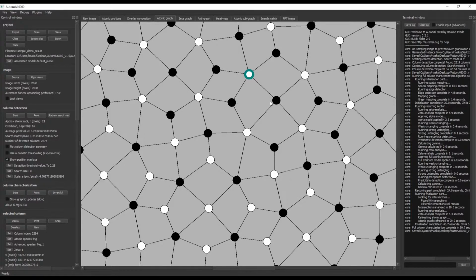Now for aluminium, it takes on 4 opposite plane nearest neighbors. And again, we can see that the program has correctly selected this as aluminium because it has 4 symmetric arcs. And then finally, magnesium takes on 5 opposite plane nearest neighbors. We see one here. There's 1, 2, 3, 4, 5. And again, we can see that this is correct because it has 5 symmetric arcs associated with it.